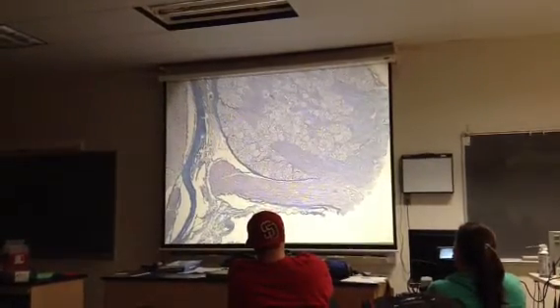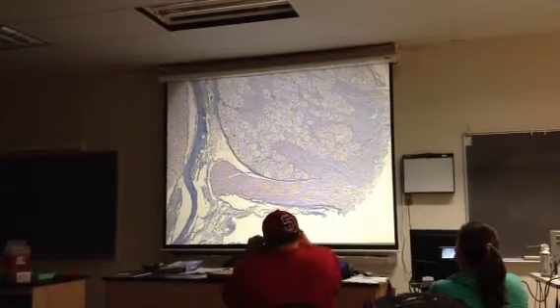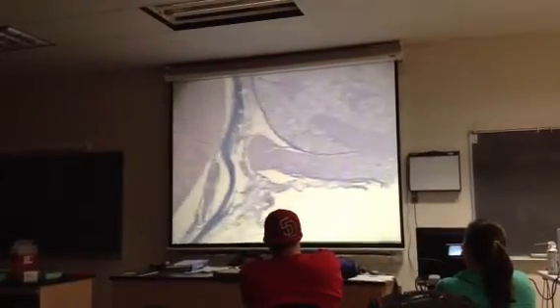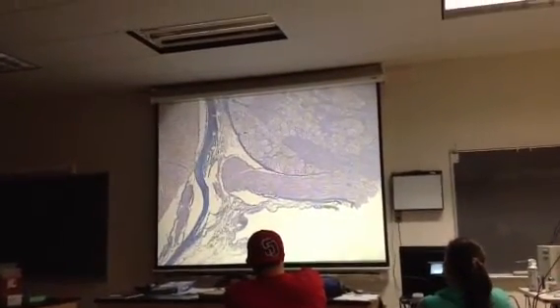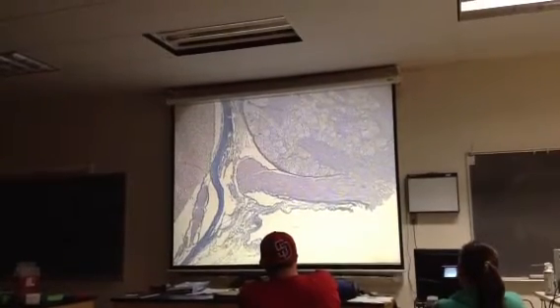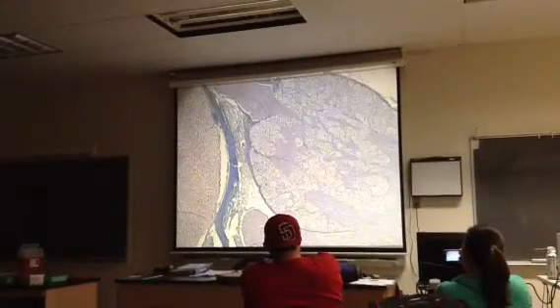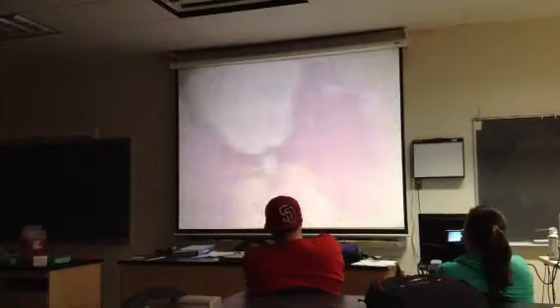And it's a transition, so you do see some axons stretching in there. Okay, and so then coming out over here would be the other side of that dorsal root. And what's happening over here on this side? That's probably the ventral root. It's a little messy. It seems to have kind of broken away from its connection to the spinal cord over here, and then it's coming together over here. That one's a little iffy. But we can definitely see the dorsal root ganglion and the dorsal root right there. Okay, let's look over here now.